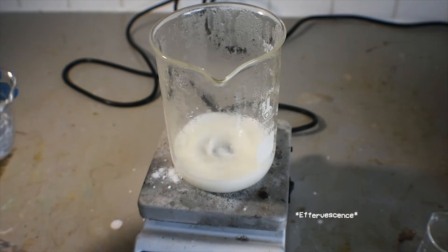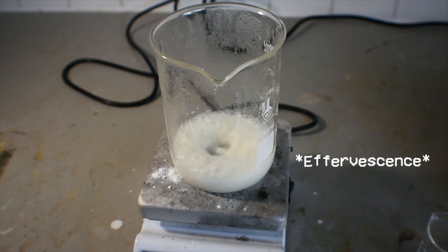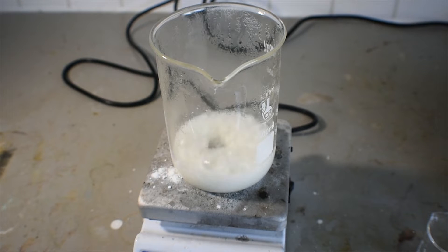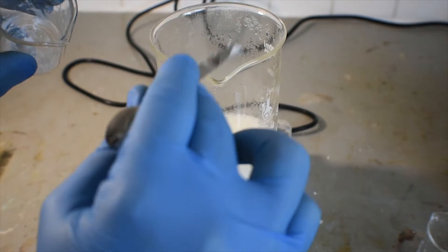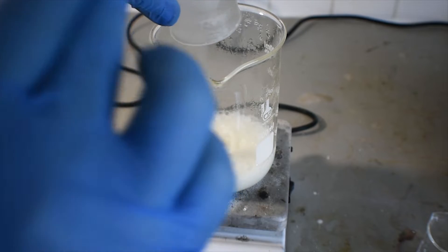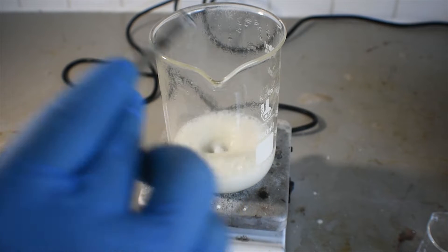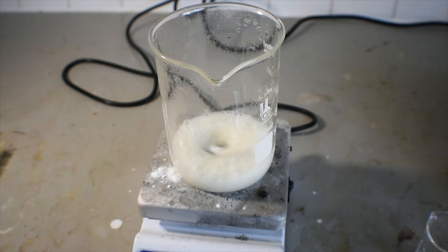Of course, try not to spill as much as I did. That's a lot of bubbles — what is going on? It seems there's a fair amount of what appears to be oxygen being evolved. Other than that, it seems to be staying in check for the most part.